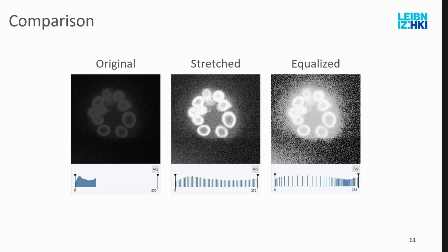I would rather go with this one here. So this doesn't mean that the fancy algorithm is always perfect and correct and you should always equalize it. There are cases where you want it equalized. There are cases where you want it stretched, although in experience, usually stretching is absolutely fine, or whatever defaults ImageJ uses sometimes with its own contrast limits.